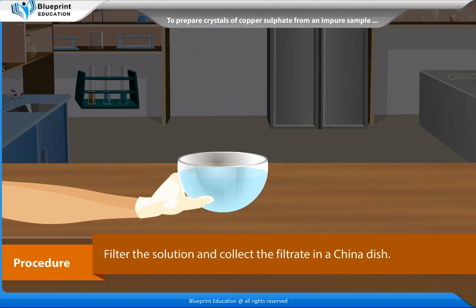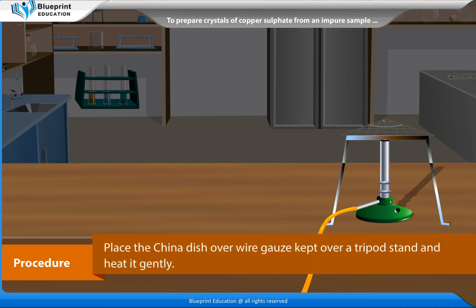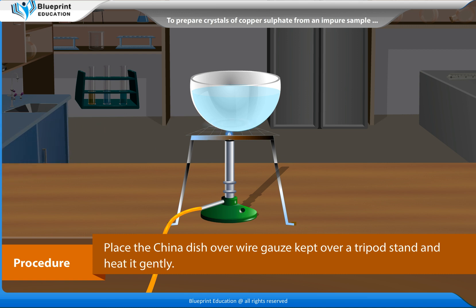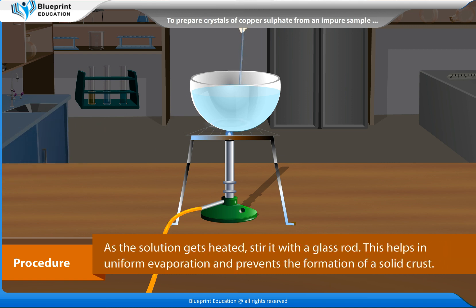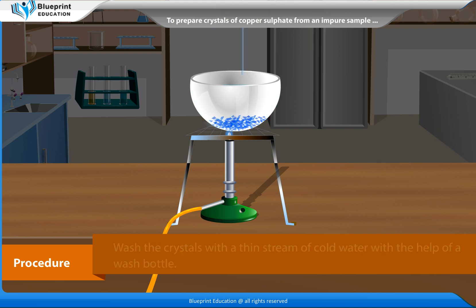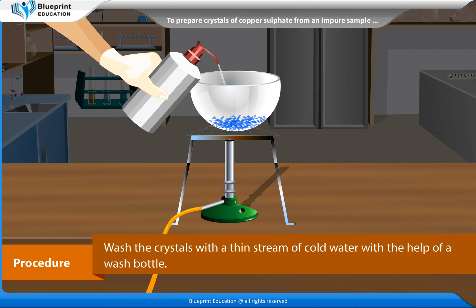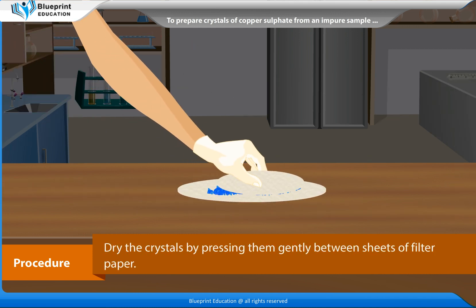Filter the solution and collect the filtrate in a China dish. Place the China dish over wire gauze kept over a tripod stand and heat it gently. As the solution gets heated, stir it with a glass rod. This helps in uniform evaporation and prevents the formation of a solid crust. Wash the crystals with a thin stream of cold water using a wash bottle, then dry the crystals by pressing them gently between sheets of filter paper.